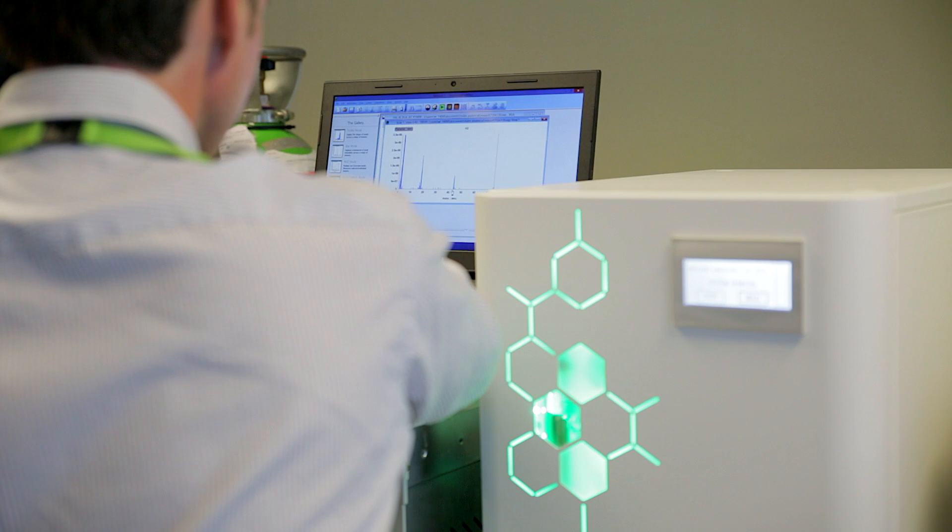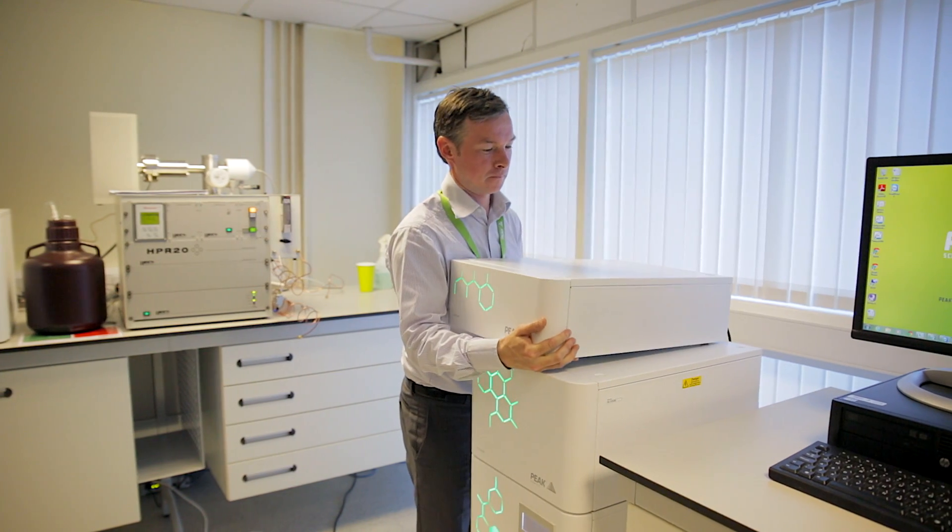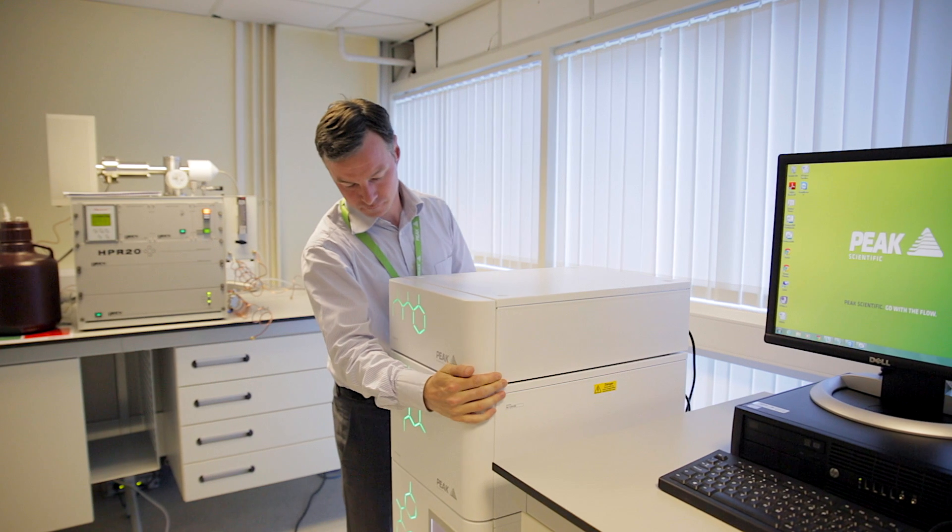You're also dealing with a much lower volume of gas in a gas generator. The full precision stack offers you three gases plus compressed air and takes up the space of around one large cylinder.